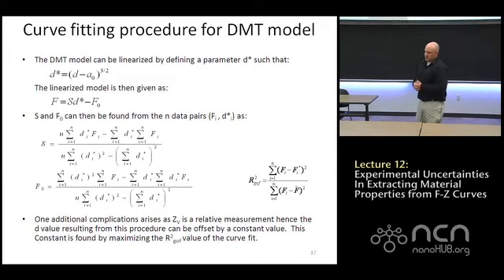But if d is equal to 0, it's the minimum of the DMT, right? Then aren't all the values of d negative? Well, it depends which way you define positive. The model defines positive D, or I've defined in the model when I'm using this, positive D as more indentation. Oh, I'm thinking of the opposite.